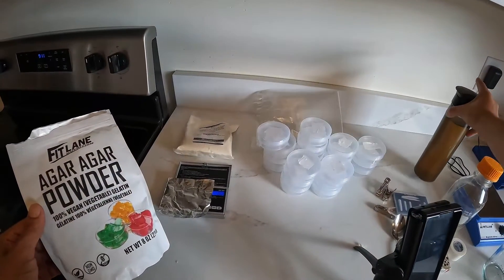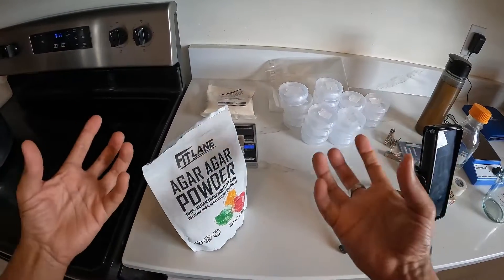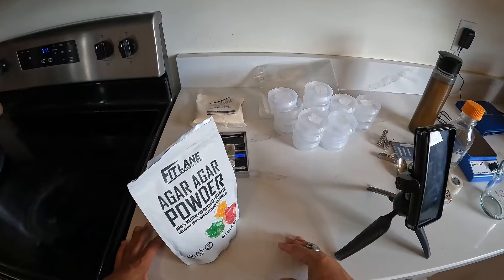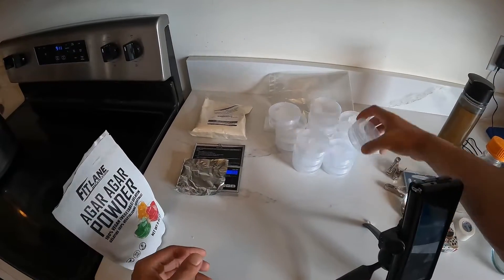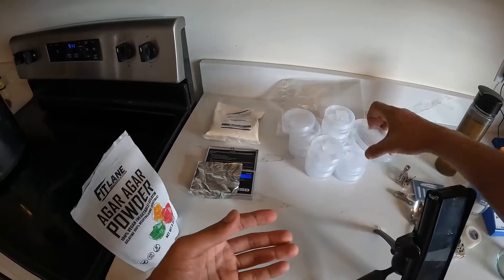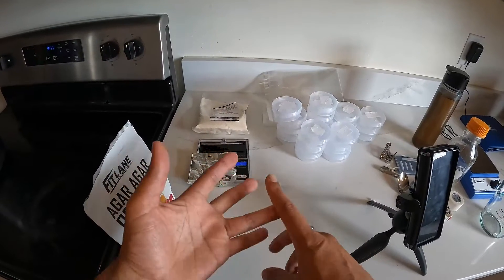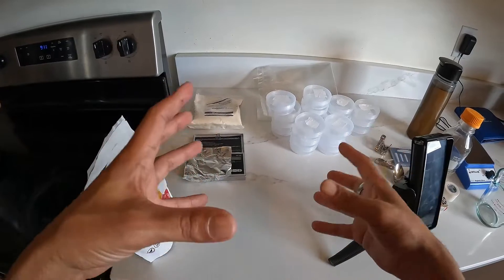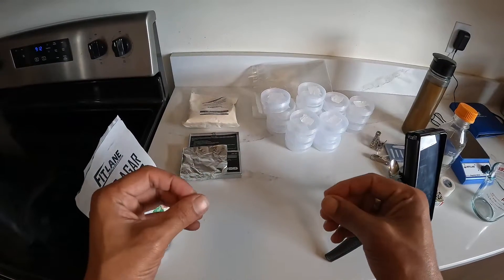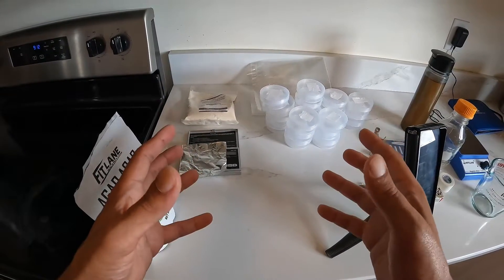After you soak the berries, the water is not waste — it can be used to create liquid cultures, which is an advantage because as mushrooms or mycelium expand their territory, they excrete enzymes, and those enzymes help break down the food matter. Depending on what they're eating will often determine what type of enzymes they're producing. If you already have them in the petri dish eating or digesting with those types of enzymes, when you put them onto the rye in the jar, oats, wild bird seed, or in the bag, it's going to help speed up the growth.